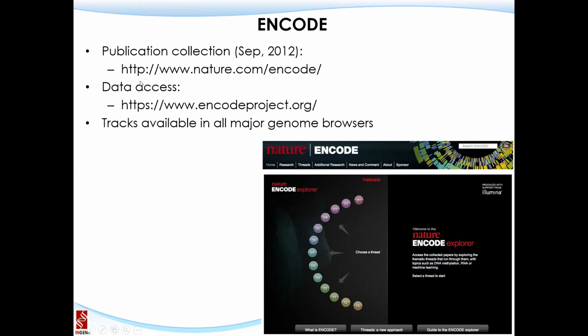And the data can be accessed through this website, and all the tracks of those are available through the UCSC Genome Browser and other browsers as well. Okay, which Guanglong will talk about in the next couple of lectures.